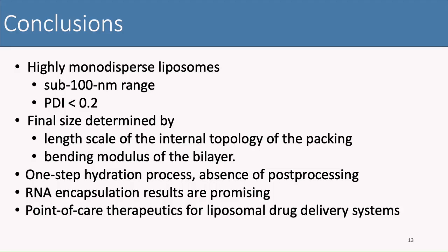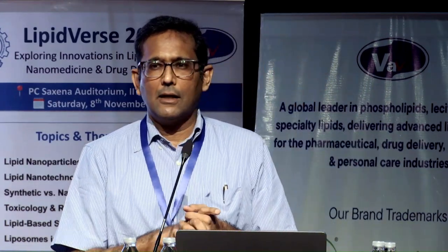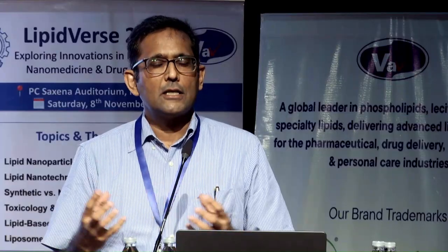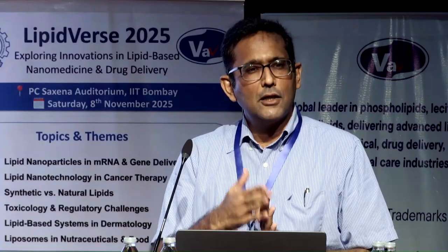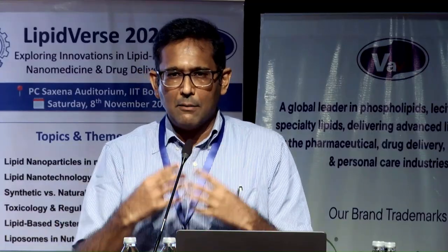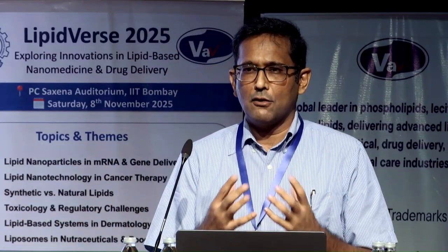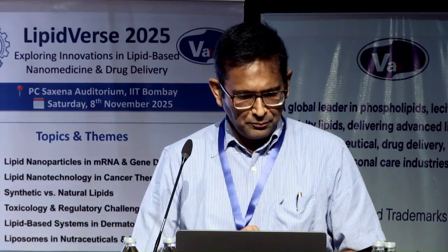The final size, we believe, and this is a hypothesis, is not determined by the size of the particle which makes up the packed bed, but really the roughness on the surface of the particles. The reason we say that is because we took different sizes of these alumina particles which make up the packed bed, and still the distribution of the liposomes that we got was very, very similar. Since they are all alumina with the same kind of surface morphology, we think it is the surface morphology rather than the bulk size of those particles that determines it.